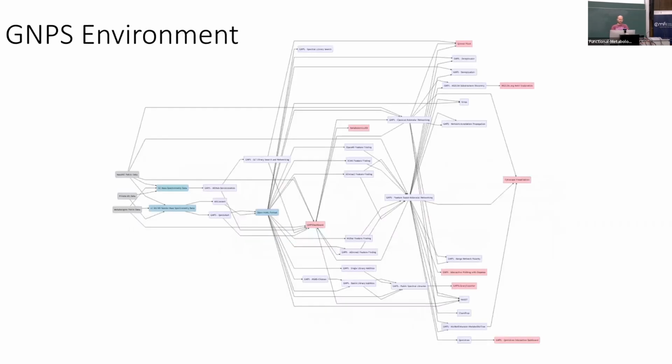All right, so where's the dashboard located? Here just a couple of words about GNPS. We only showed you the feature-based molecular networking workflow, but the GNPS environment actually has a lot of different data analysis tools. And the more you dive into it, maybe the more tools suitable for your personal needs you will find.